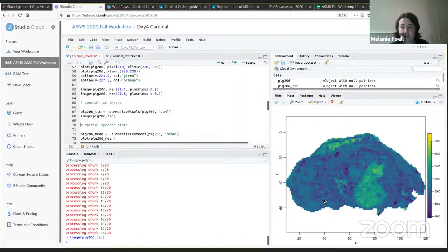So we will divide each peak intensity by this TIC value, because we assume that in areas where the TIC value is higher, probably the whole spectrum is shifted towards higher values and needs some normalization to become more comparable to the other spectra.